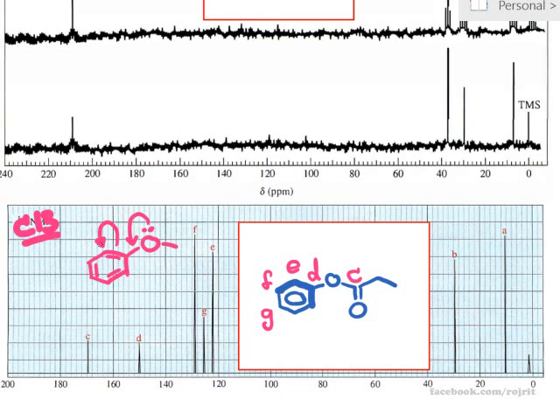Okay. Now we have A and B left. So B is here because B is next to the carbonyl. For proton NMR, it has to appear at about 2 ppm. So you multiply by 15, and it ends with 30. And as you can see, B here appears at 30. So this is B and this is A. So that's it.